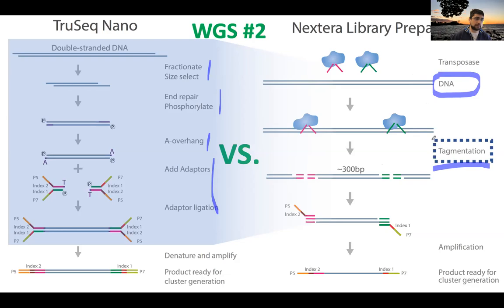As we discussed before, it's an enzyme. This transposase has been engineered to have fewer biases, but it still has some biases. If you remember one of the first few slides that I showed you, comparing sonication and enzymatic restriction digestion, you still have the bias coming from the enzymatic fragmentation, but it's very minor. Especially if you have thousands of samples, this might save your life.